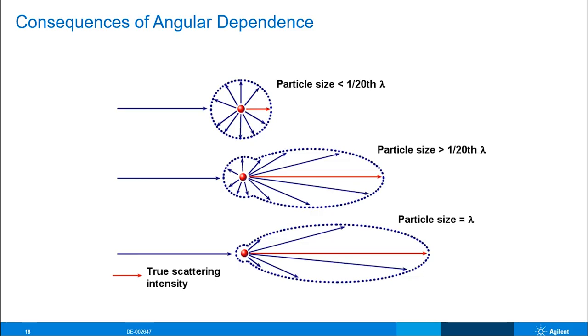The important thing to note with the anisotropic scattering regime is now as we start moving down to examples 2 and 3, as these molecules get larger and larger, we see more and more angular dependence within these molecules themselves. This allows that particle scattering factor to be thrown back into the equation and allows for us to calculate a radius of gyration of that material.